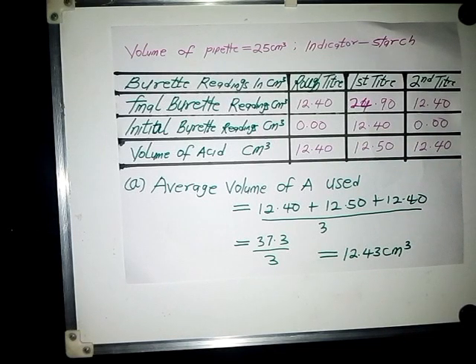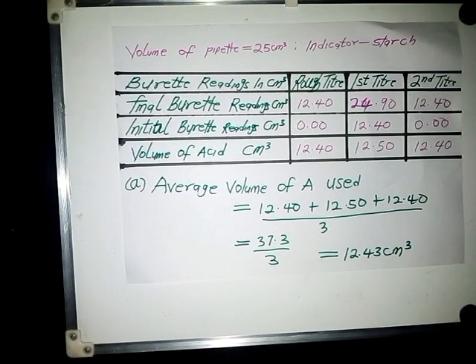So when I start, remember your thiosulfate will be inside your burette, while your iodine, you have to pipette iodine. Your iodine is golden brownish. It has a golden brown color. That is iodine. The thiosulfate is colorless. It's the one that will be inside your burette. Then when you start titrating, your iodine will be inside a conical flask.